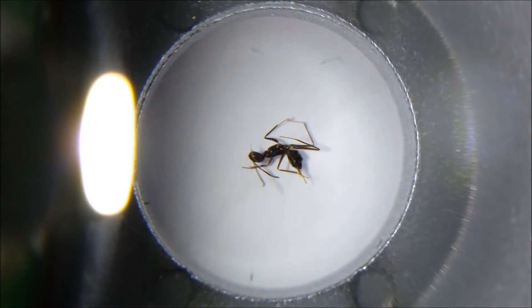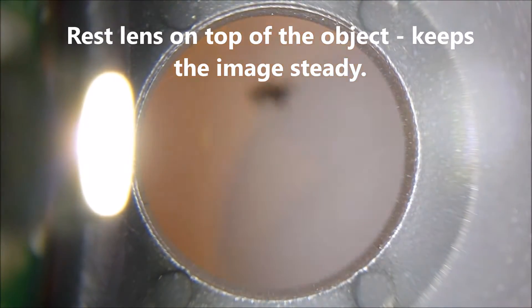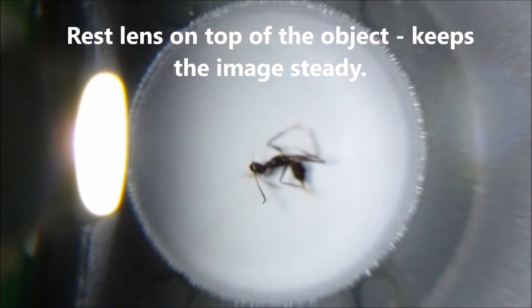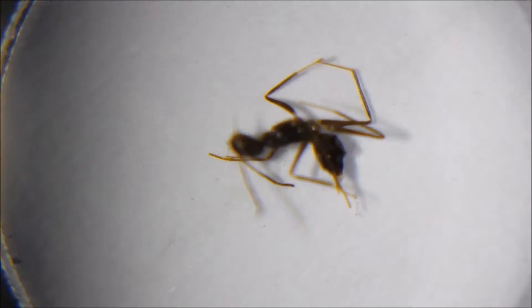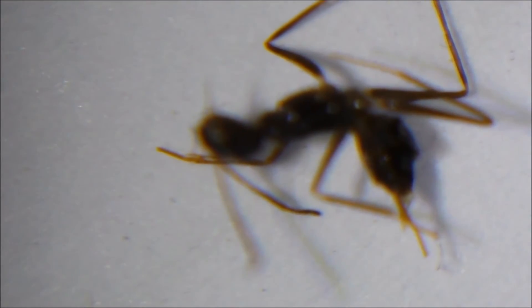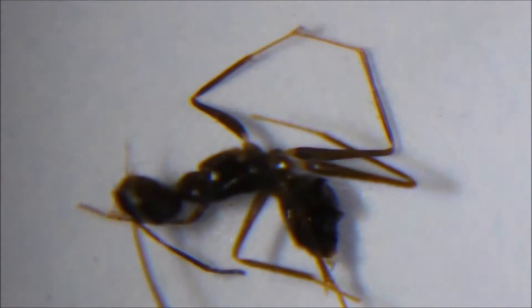I have a dead ant. It does look like you have to get real close — I was trying to do it from afar and I couldn't get it to do anything. So you have to put it right on top of the dead ant. That's interesting. Literally you've got to put the camera lens right on it.